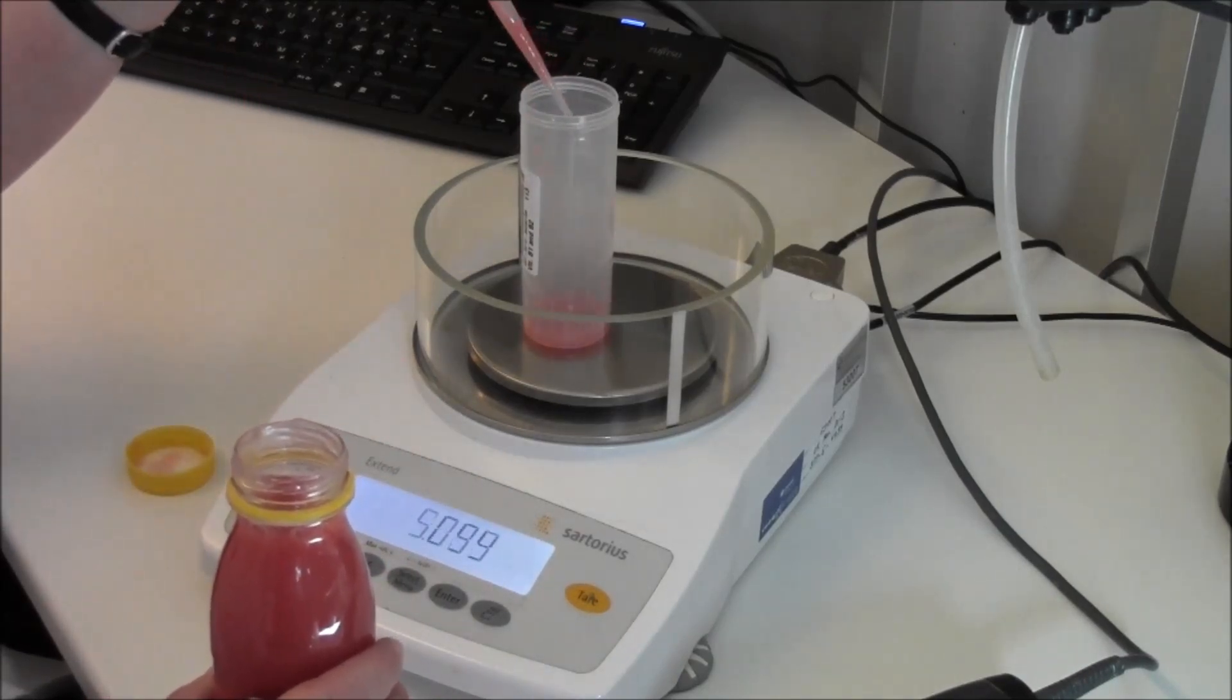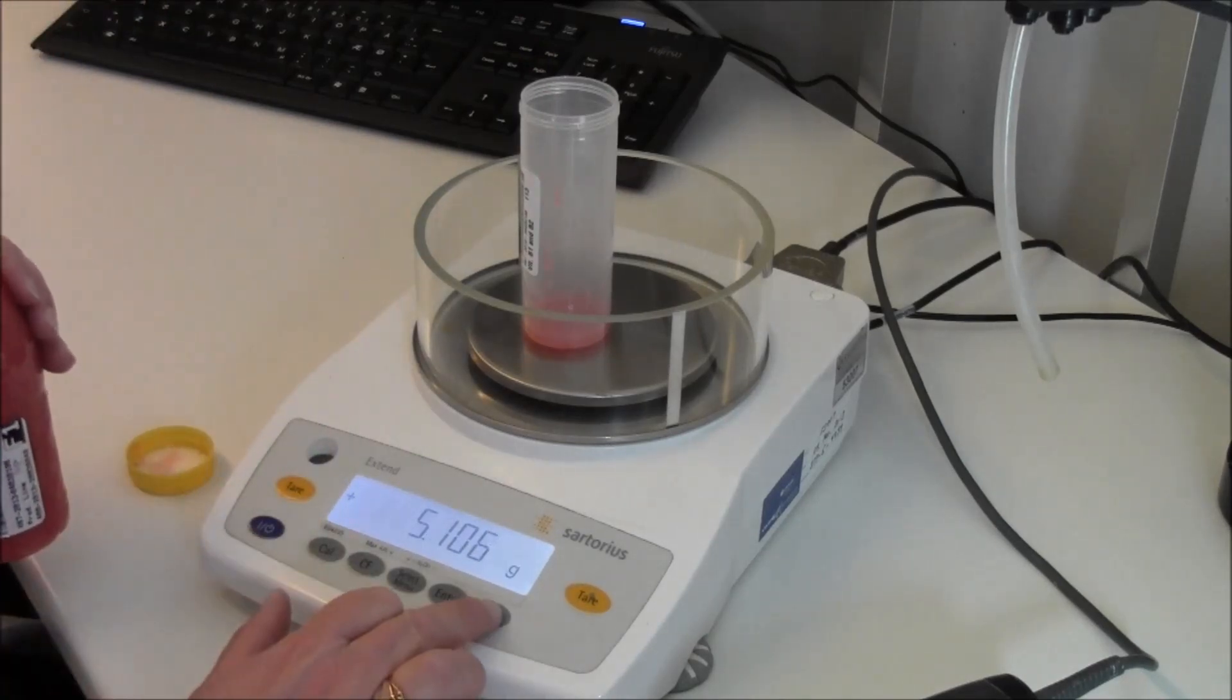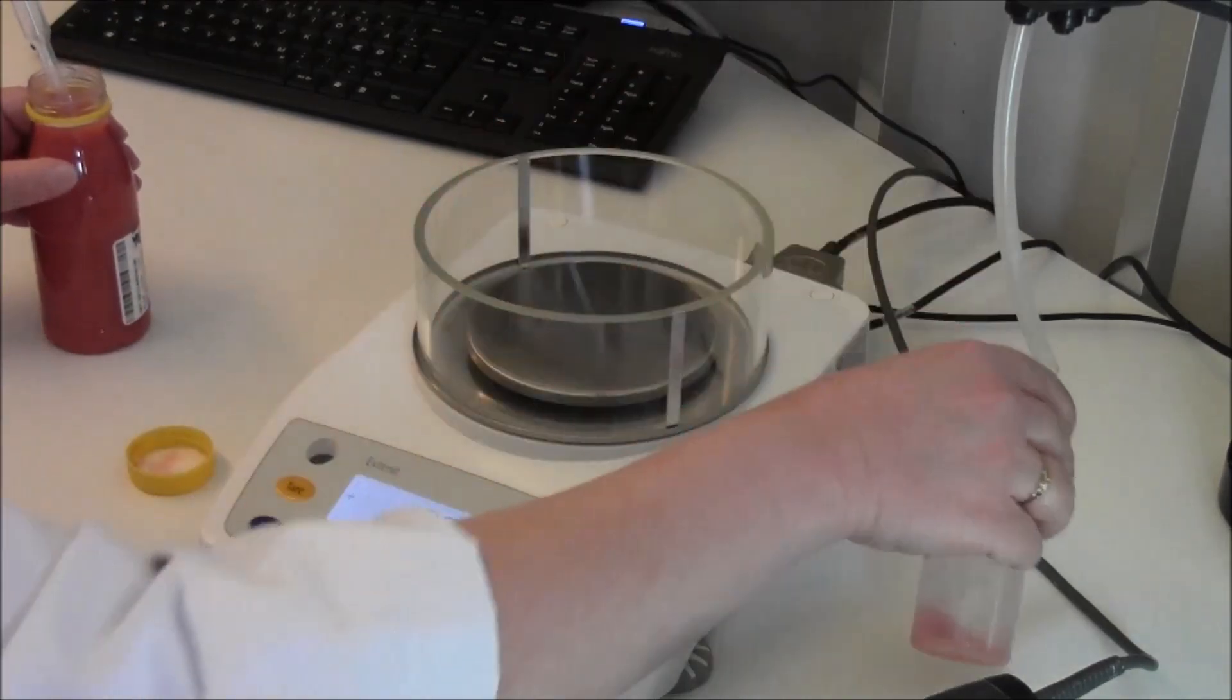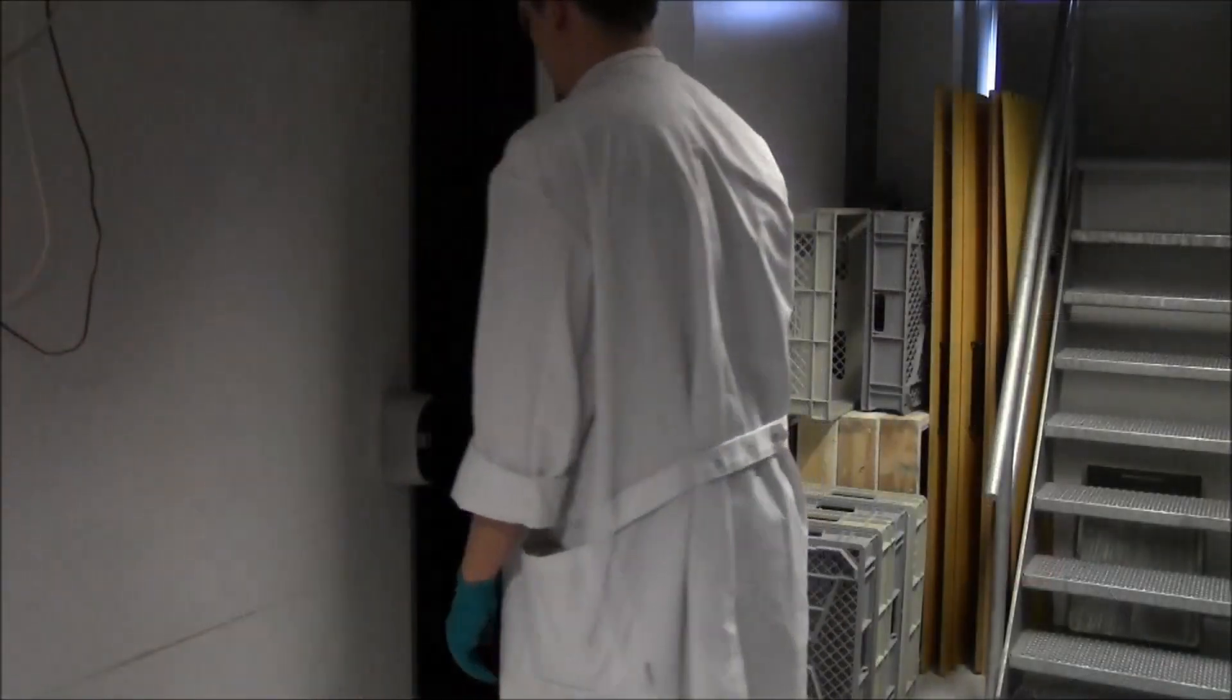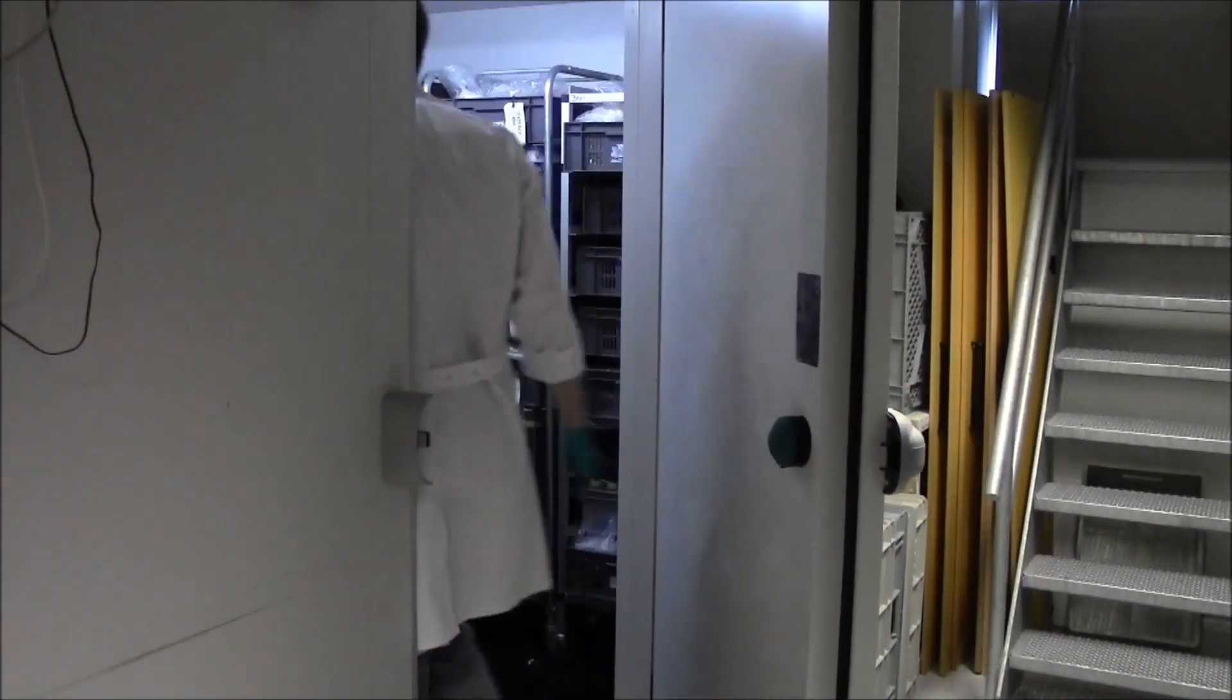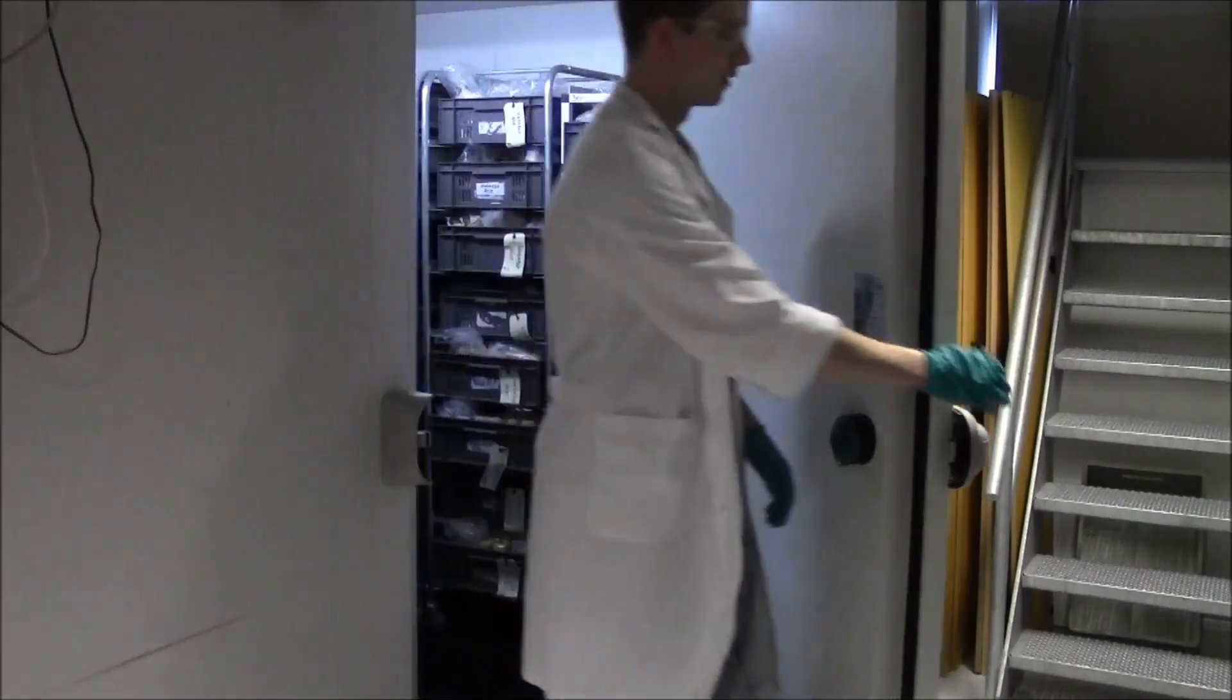After weighing, the samples are blown with nitrogen to avoid degradation by oxygen. All samples are stored at minus 20 degrees Celsius to delay any degradation of the vitamins.